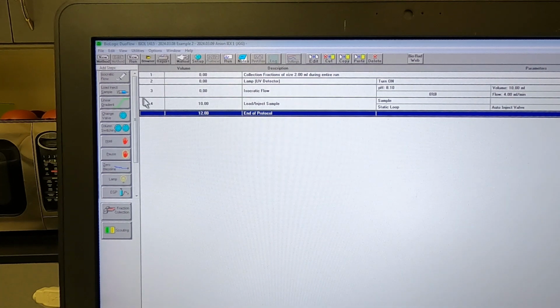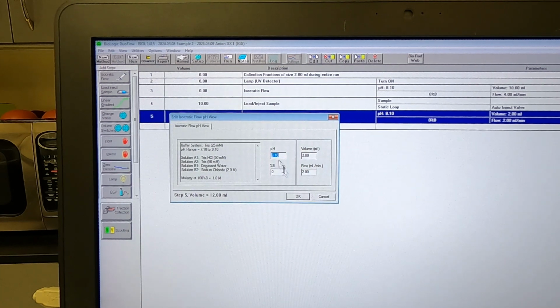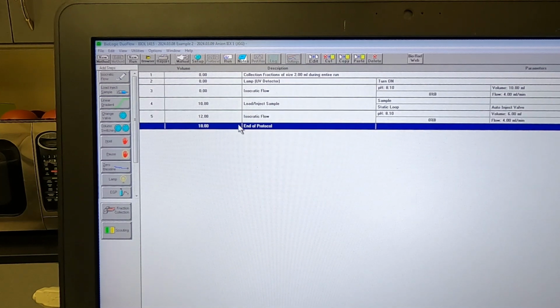Now we want to start washing. So we'll do that by adding an isocratic control command. We'll maintain pH at 8.1, percent B at 0. And then we're going to flow 6 milliliters, or 6 column volumes through, at a flow rate of returning to 4 milliliters per minute. So you can see it's been added.